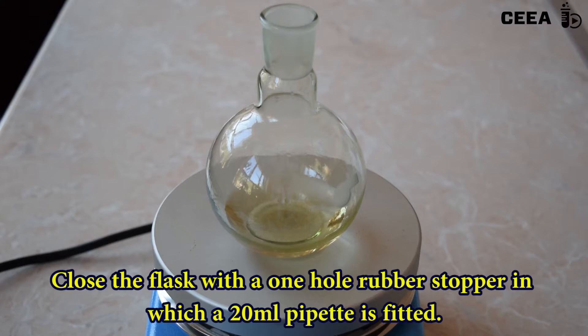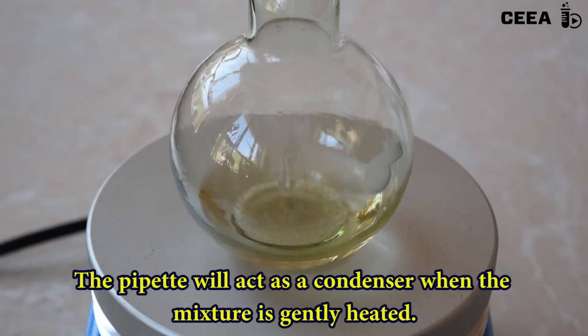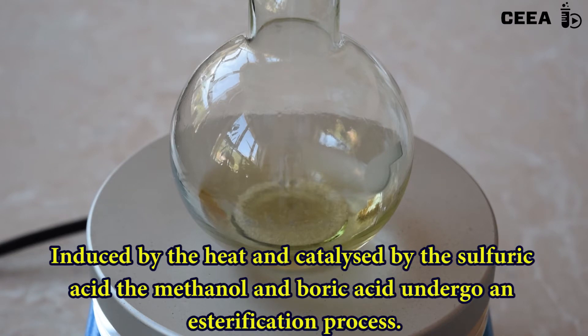Close the flask with a one hole rubber stopper fitted with a 20 ml pipette. Place the flask on a hot plate and gently heat it to allow refluxing. An esterification process will go on, generating volatile boric esters.